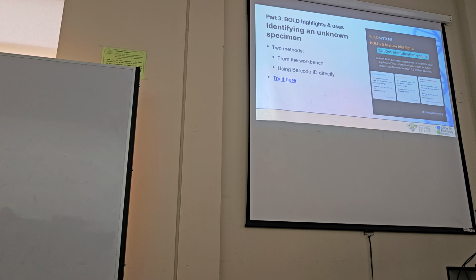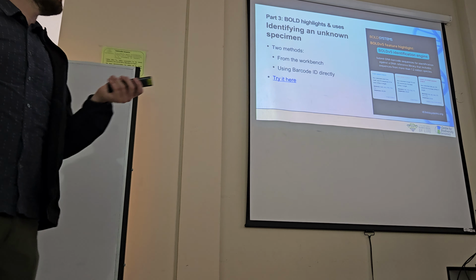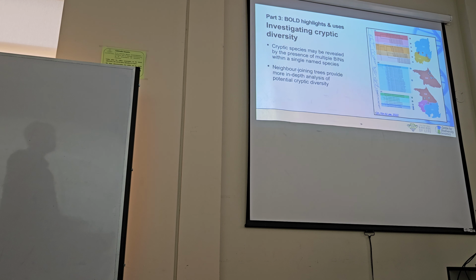But what you could do if BOLD was working is you could search a sequence, find a species, find a barcode, and identify it. Okay?